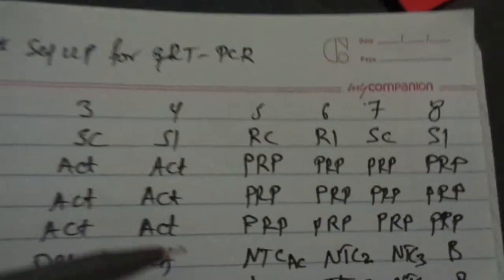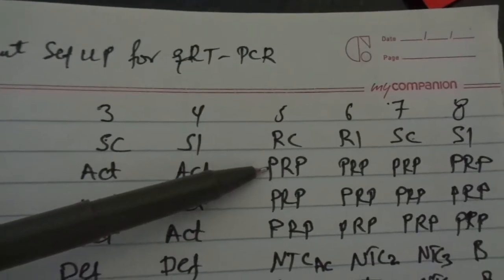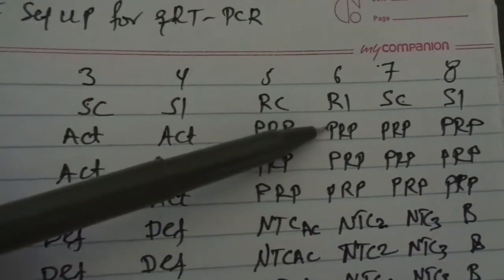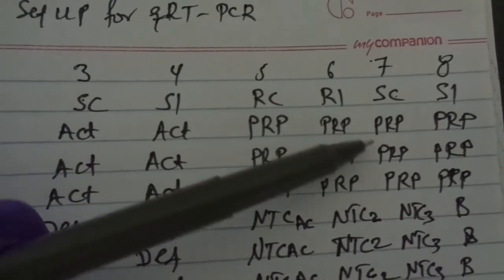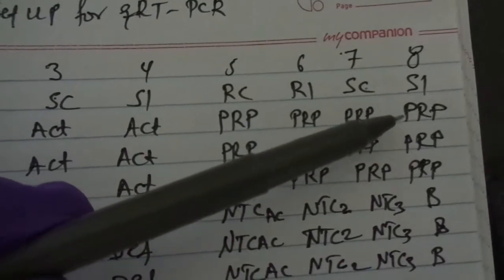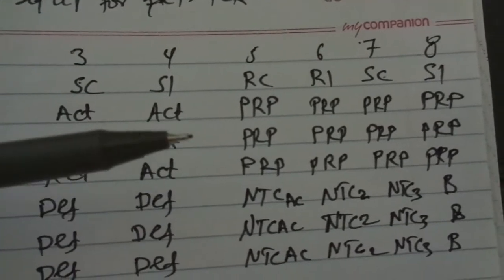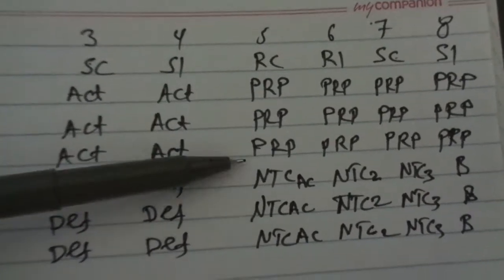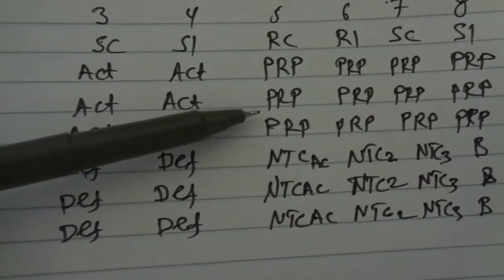The third gene is the pathogen resistance protein gene. This also is replicated 3 times, 1, 2, 3. For resistance inoculated, 1, 2, 3. For susceptible control, 1, 2, 3. For susceptible inoculated, 1, 2, 3. So replication is very important to reduce personal errors. We will take the average of the 3 replications, so it will reduce variation and some personal errors.